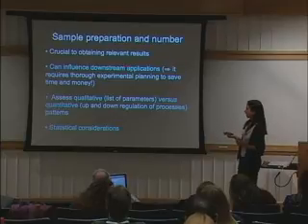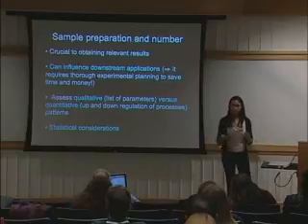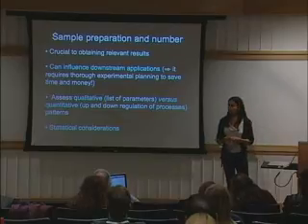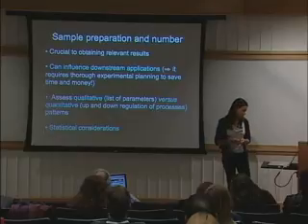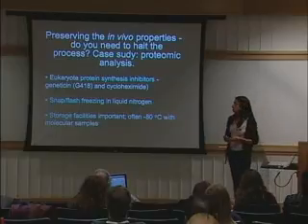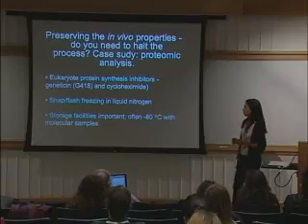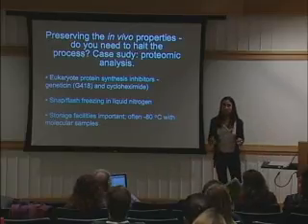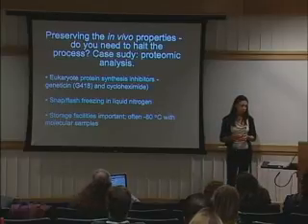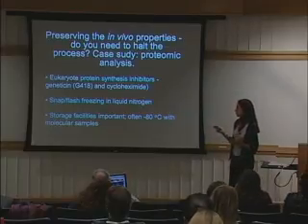And you need to assess the parameters. Some of them you can only assess qualitatively, but try to work on quantitative parameters like up and down regulation of genes, and we can do this with iTRAQ, with quantitative proteomics, and also work with bioinformaticians for these statistical considerations. And one example about the sampling that you need to do, well, you have this protein synthesis that happens on a very short time scale, so you have to work as fast as you can, basically, and then we can try to use protein synthesis inhibitors like geneticin or cycloheximide.